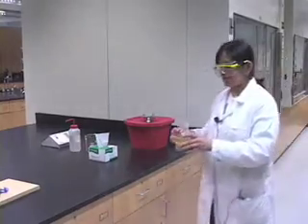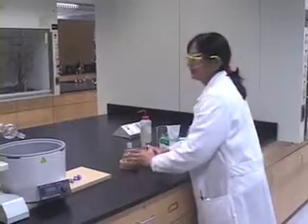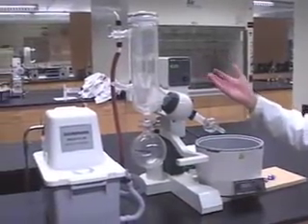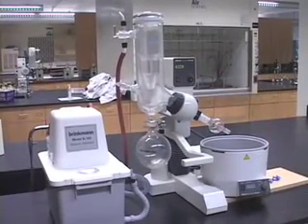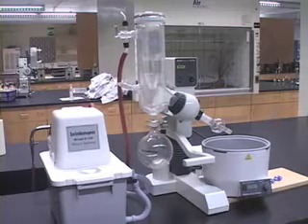Now we are bringing these solutions to use the Rotovap. So this is the complete setup of a Rotovap. Alright, let me explain to you different parts of the Rotovap here.